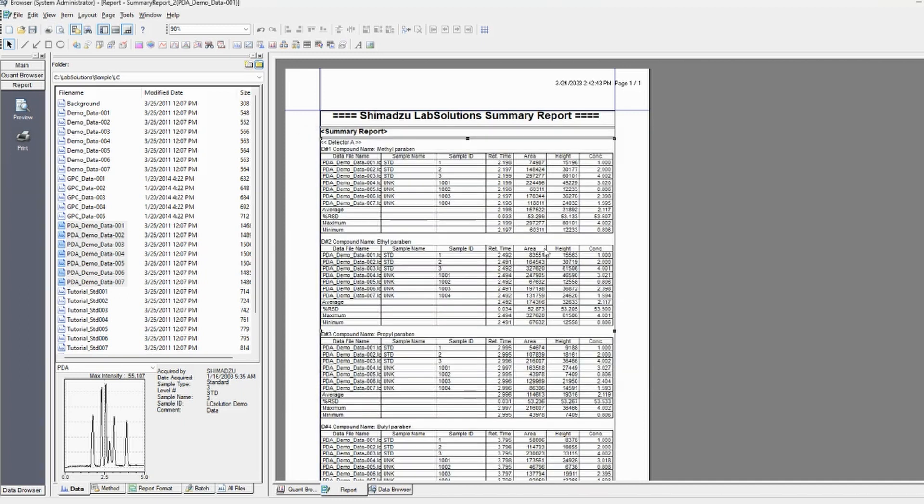I would recommend doing this if you're processing samples all the time and you want the same report format. It's worthwhile to customize this.